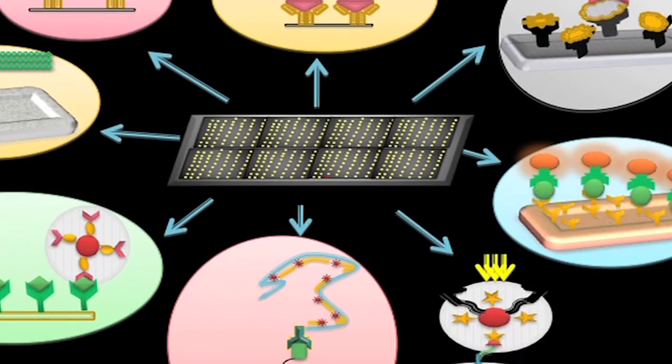To summarize all the various types of detection techniques which we have discussed today, the advancement in microarray technology has led to the development of sensitive and reliable detection systems. There are different label based detection techniques which have been employed to study high throughput ways of analyzing thousands of proteins as well as studying their interactions and function by using the protein microarray platform.